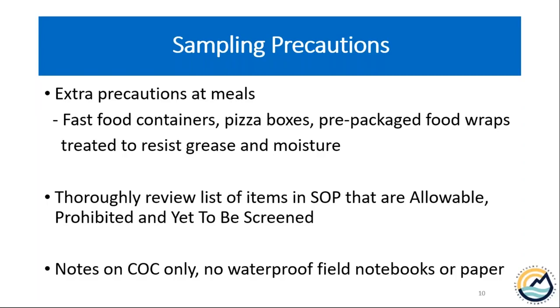Also, notes will go on the chain of custody form only. That's on plain copy paper. We can't use waterproof field notebooks or waterproof paper when we're in the field because that will contain PFAS as well.